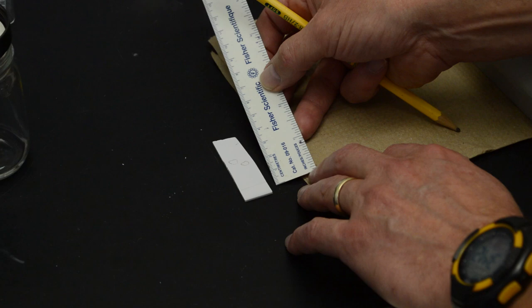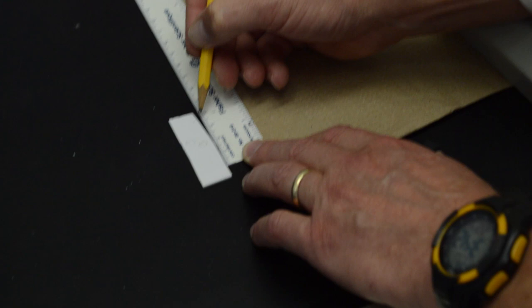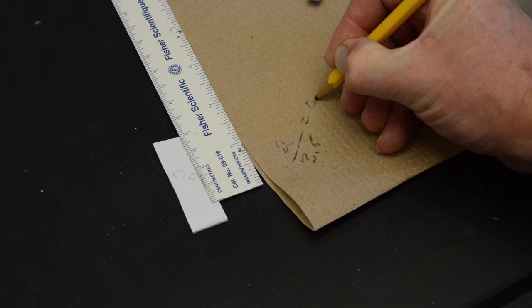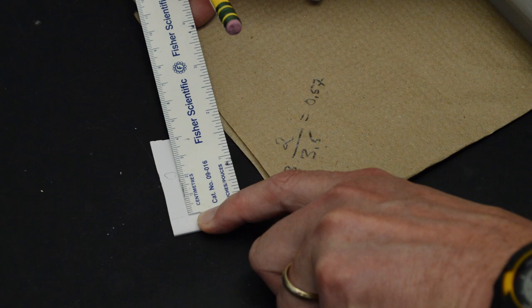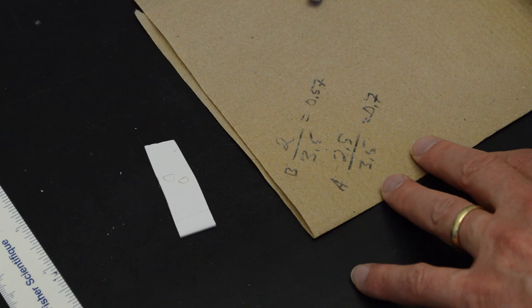We now calculate an RF for the spot, which is the distance from the bottom line to the spot, which in this case is 2 cm, divided by the distance from the bottom to the solvent front, which is 3.5 cm. So 2 divided by 3.5 is equal to 0.57 for spot B. For spot A, this spot is up approximately 2.5 cm. So spot A is 2.5 divided by 3.5, which is equal to 0.7. So the RF for A is 0.7, the RF for B is 0.57. It is an indication of how far up the plate the spots traveled.